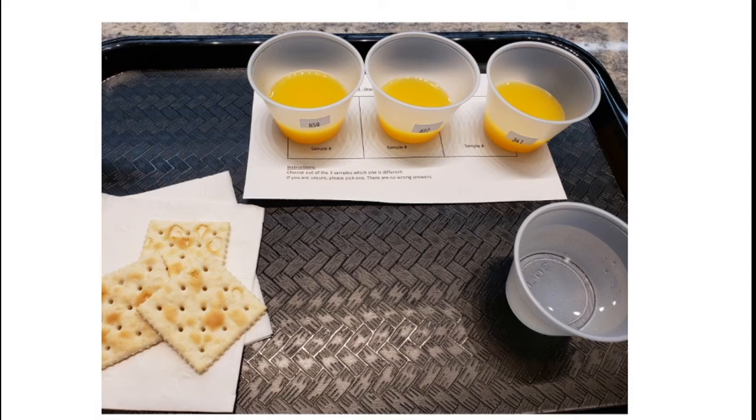How does this look in real life? Well, here's an example of a tray that we had set up. So you'll note, in this case, we did the questionnaire, and we actually made a placemat out of that questionnaire. And what you can't see under the samples is that we also had those pricing gun tags. We had the pricing gun tag, and it just happens to be obscured underneath the cups here. But we turned the questionnaire into a bit of a placemat as well. So they were presented with the 3 samples and the questionnaire. We also can't see that there's a pencil over here.